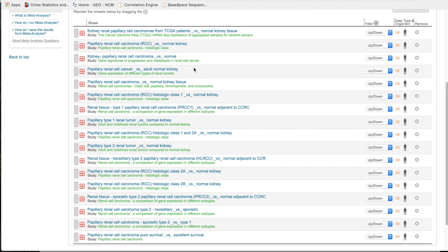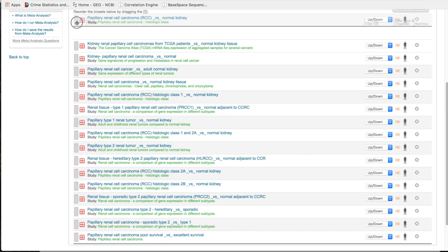Again, these are from 8 different studies. I mean, there are millions of dollars worth of research data in all these comparisons, and we get to use it, which is really, really cool. And the nice thing is we don't have to believe just one group. You know, we can take all the results and basically get our own information. The nice thing about this page is you can kind of put this wherever you want.